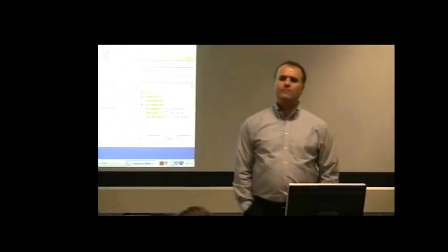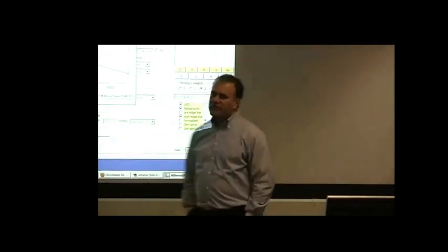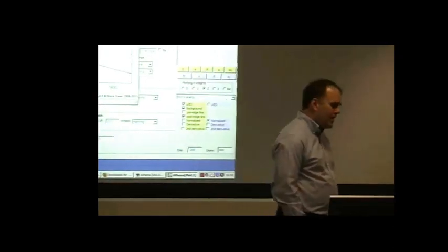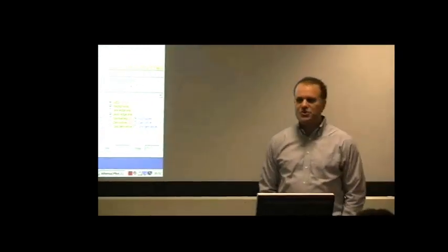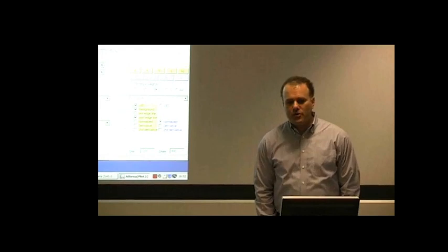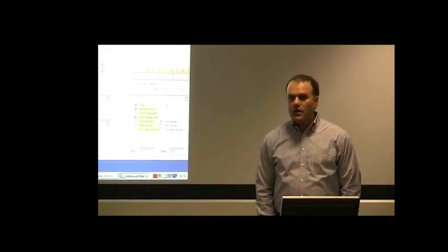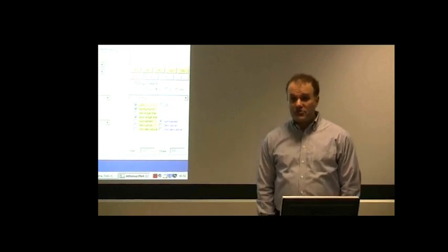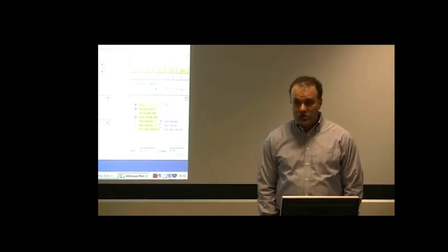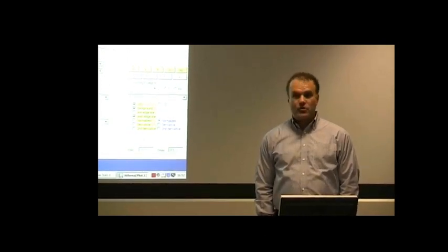So here's an experiment you can do. If you expect that you're going to go to the synchrotron and measure an ensemble of data for which you have this problem, what you want to do is convince yourself in a controlled scenario that you can do the normalization consistently. That is, in a situation for which you know what the answer is, you want to prove to yourself that you can get the answer. If you can do that, then you'll have more confidence that you actually do know how to do the normalization in a way that counts as sufficiently consistent.